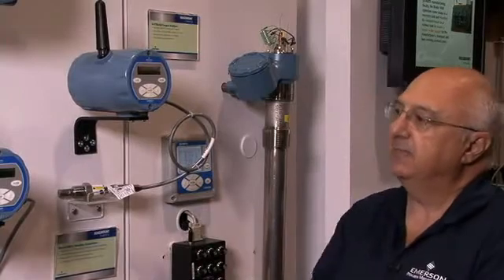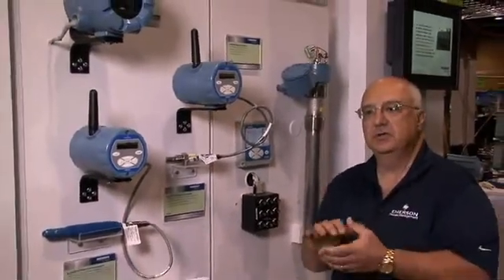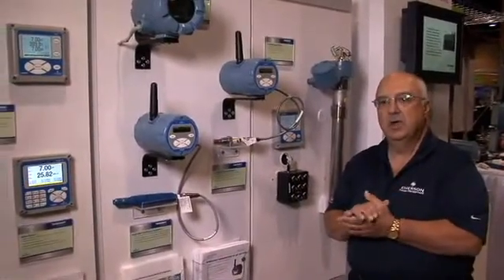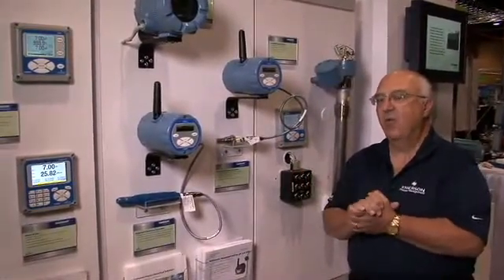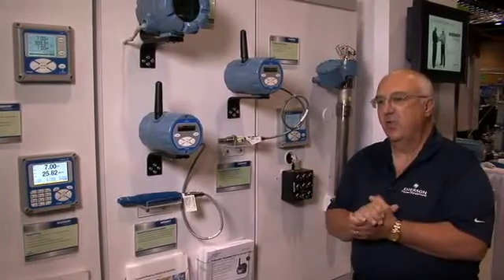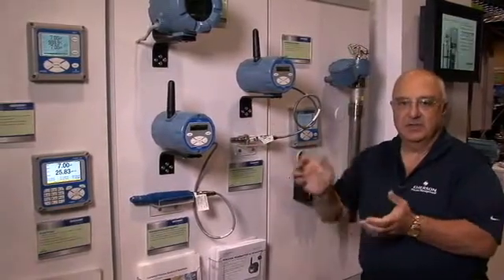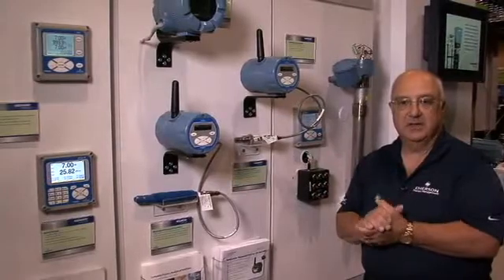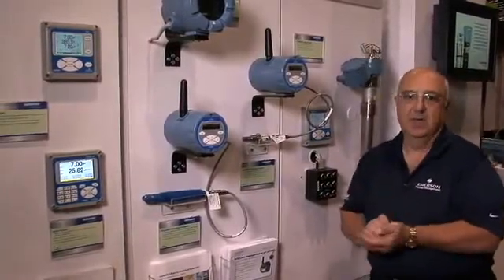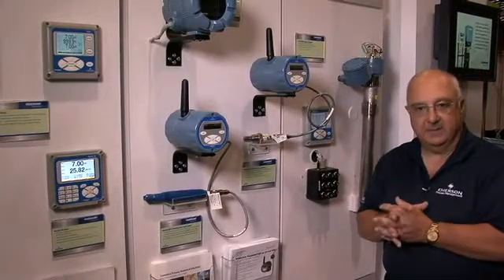To give you an idea of some of the applications these devices have been used in: we have customers that are actually using these out in the outfalls, trying to keep environmental compliance where they might be several thousand feet away from the plant itself. It's very costly to run wires back to the plant. They install this, put their battery in, put the sensor in — the smart sensor together, it's calibrated — and they're literally up and running in a matter of minutes. We have customers that do this for conductivity as well.